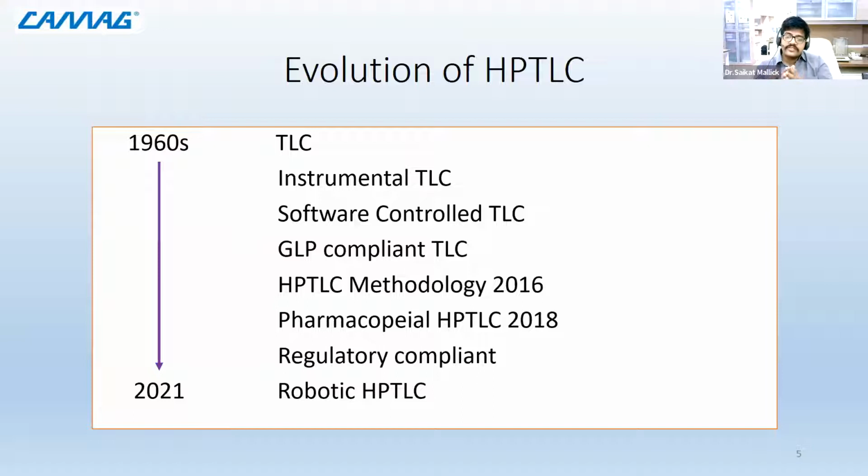Then came the acceptance to the pharmacopoeial guidelines. You have the United States pharmacopoeia, European pharmacopoeia, Chinese pharmacopoeia. In Indian pharmacopoeia, it is under revision, but you are going to have it over there as well. And many other pharmacopoeias have started adopting this as an official technique for analysis. And why should they not, if you can do the analysis at 1/5 or 1/10 the cost? Cost effectiveness is a very important aspect for everybody.